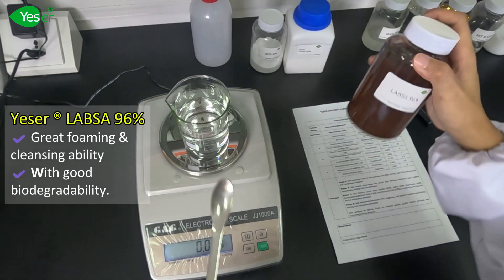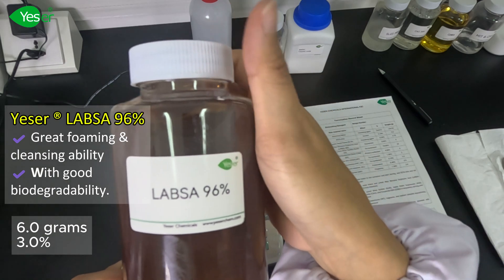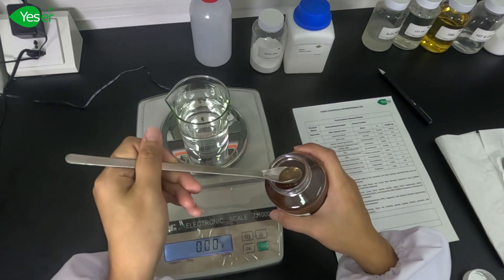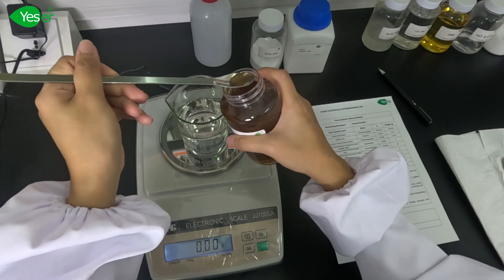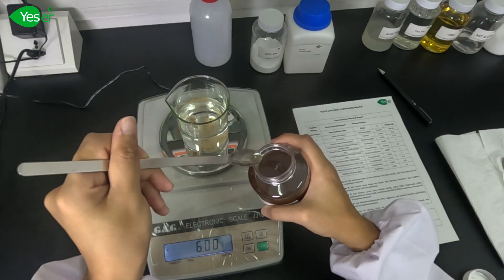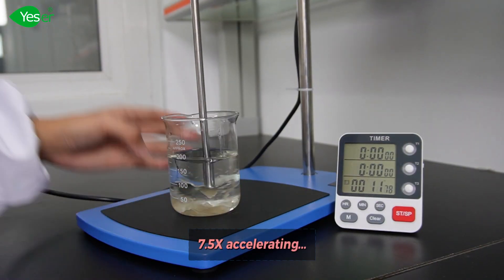Next, we have Yesure LABSA 96%. It has great foaming and cleansing ability, also with good biodegradability. We will weigh about 3% of this, or 6 grams for the formula. Mix this well in an overhead stirrer for about 8 minutes.